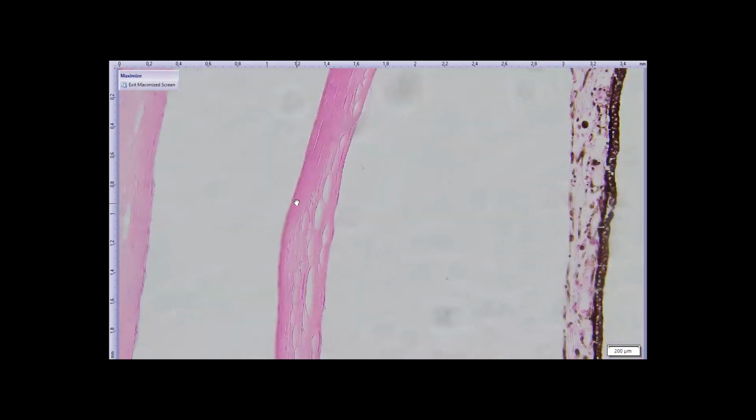Notice that the cornea is lacking in epithelium. If you have really sharp eyes, you might be able to see that there's a very attenuated epithelium. And there's also a very attenuated epithelium on the back of the spectacle. So can you suggest why that would be? Why is the snake cornea lacking in epithelium? Does it need the barrier function there? Right, that doesn't need a barrier function because it's bathed in fluid continuously.